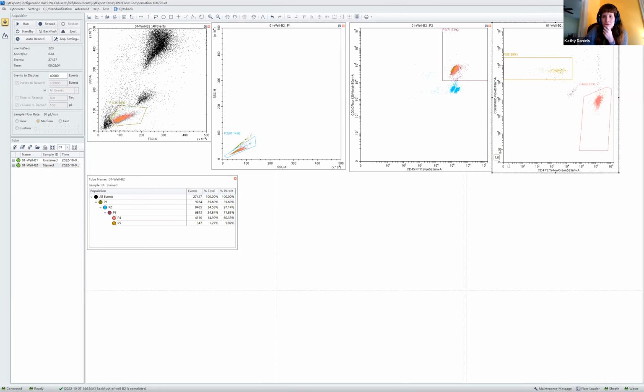I'm not sure if that's CD45 high, low, because I don't know enough about these particles to answer whether or not that's something they've built into that, but that's something that you'll typically see. So I can't answer it with enough knowledge to say exactly what it is, because these are the TBNK controls. So take my response with a grain of salt, that they might be trying to mimic high and low level CD45.